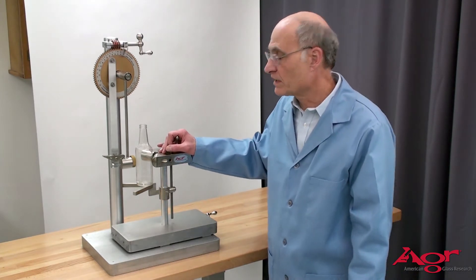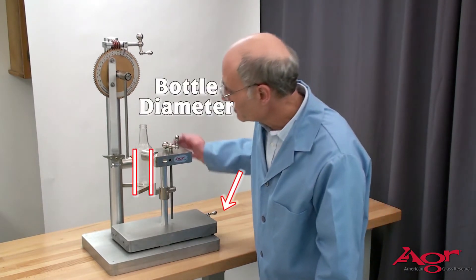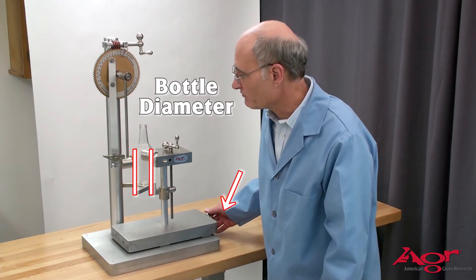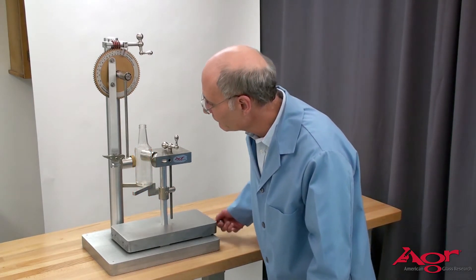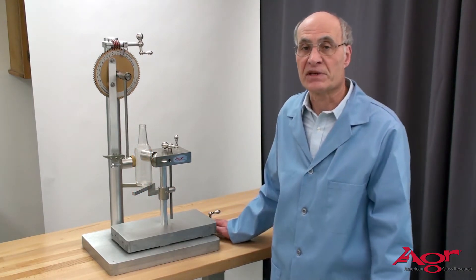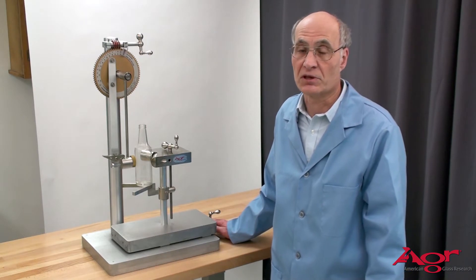The second thing you want to worry about is bottle diameter. In this case the tester is set up for a slightly bigger bottle so I just crank it over until the bottom of the pendulum touches the bottle at the bottom dead stroke.